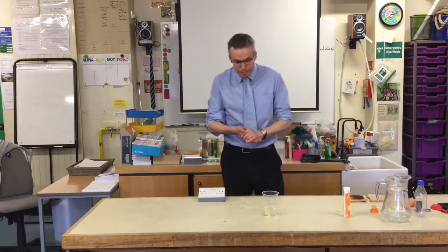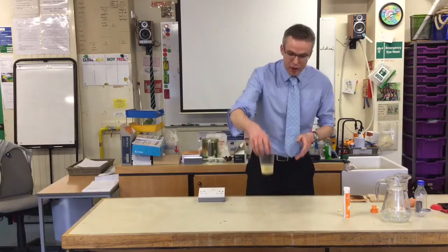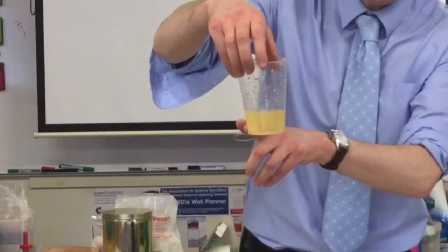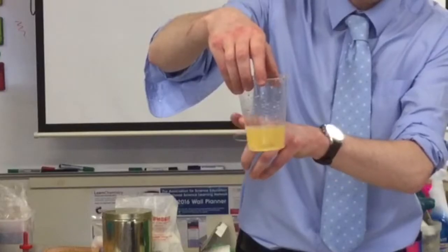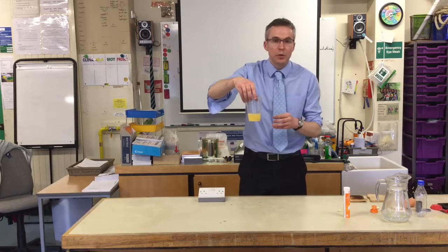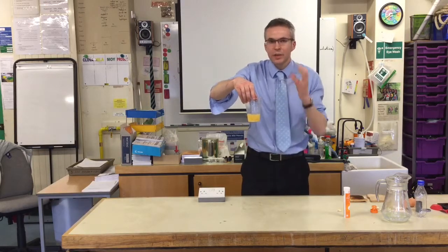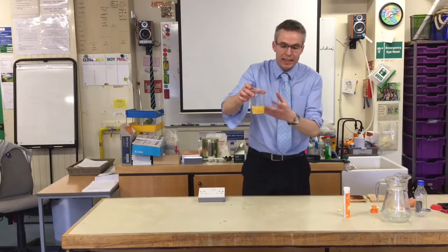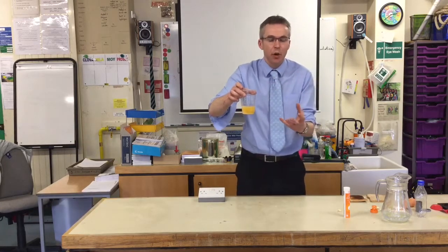As it goes in, two of the chemicals react together, and you might be able to see on the video that there's bubbles coming up from the surface of the tablet. So the bubbles are a gas. It's carbon dioxide gas that gets released from this experiment. So one of the things that people should be able to hear in this case is a fizzing. So whenever they hear fizzing, it's a gas that's been generated, and in this case carbon dioxide. So that's a sign of a chemical reaction. A gas is given off.